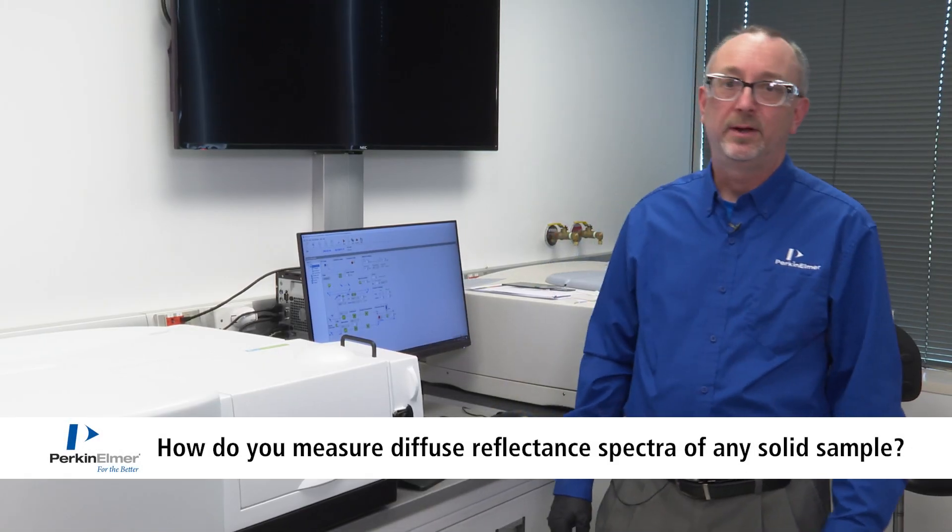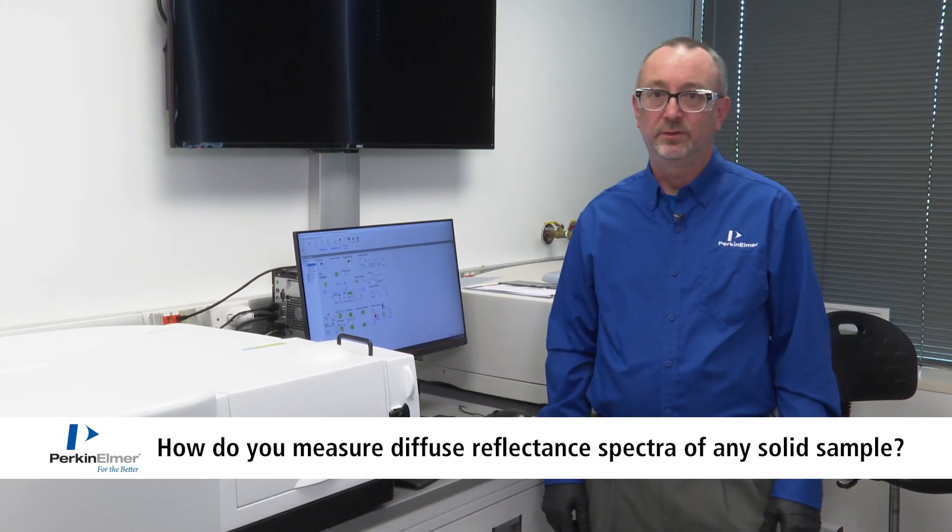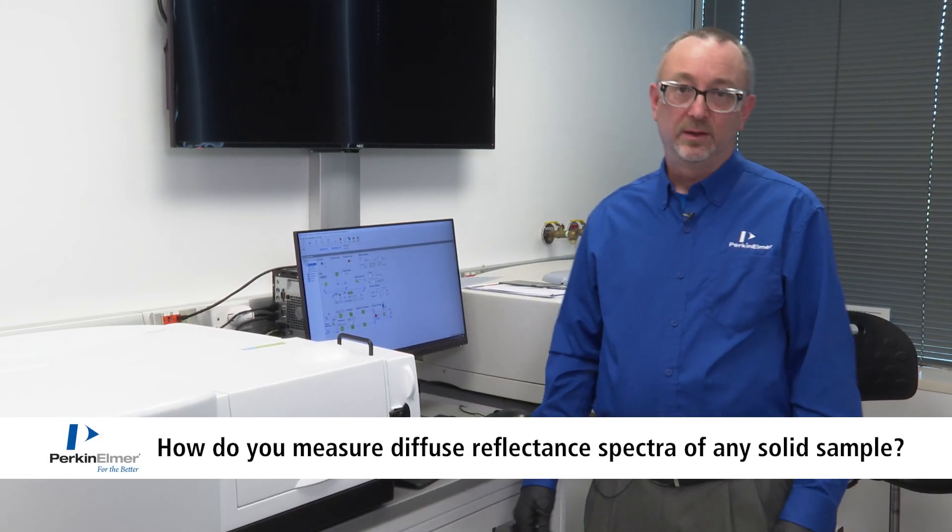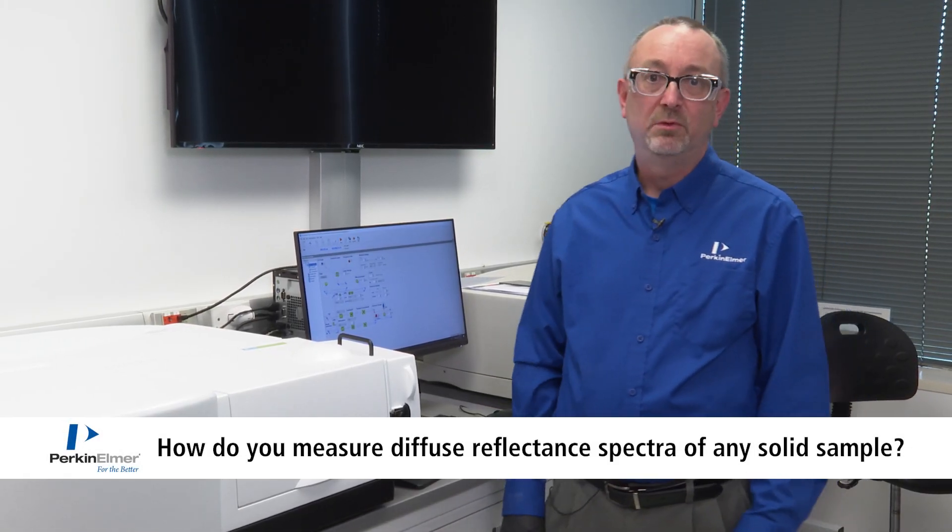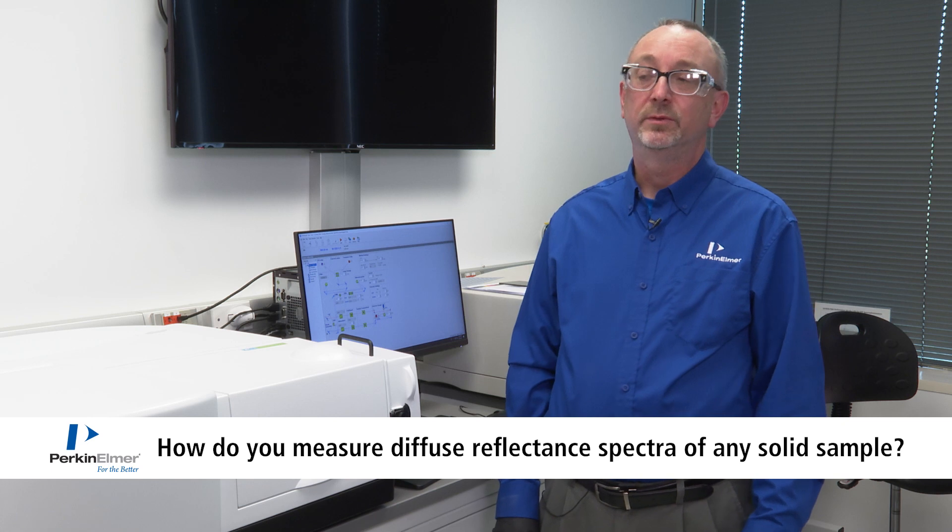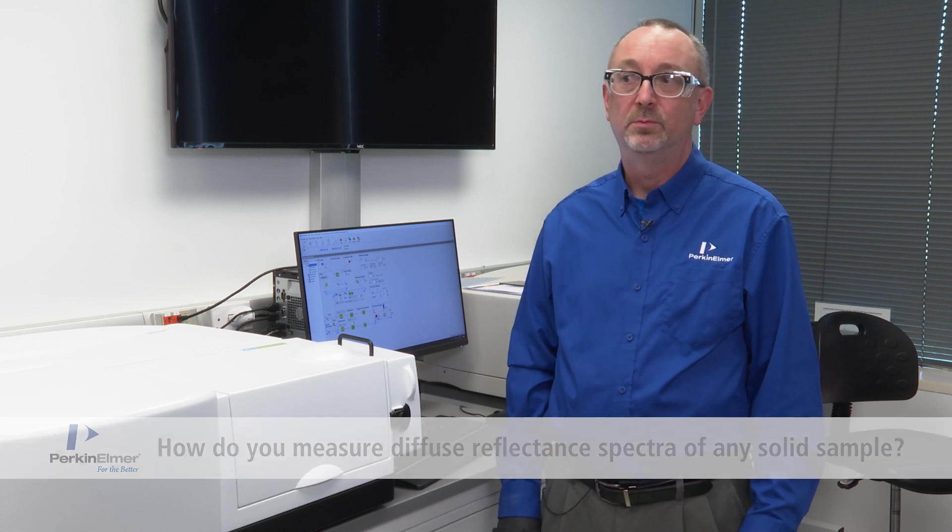A lot of people ask us about diffuse reflectance. How do I perform a reflectance measurement? How do I perform a diffuse reflectance measurement?